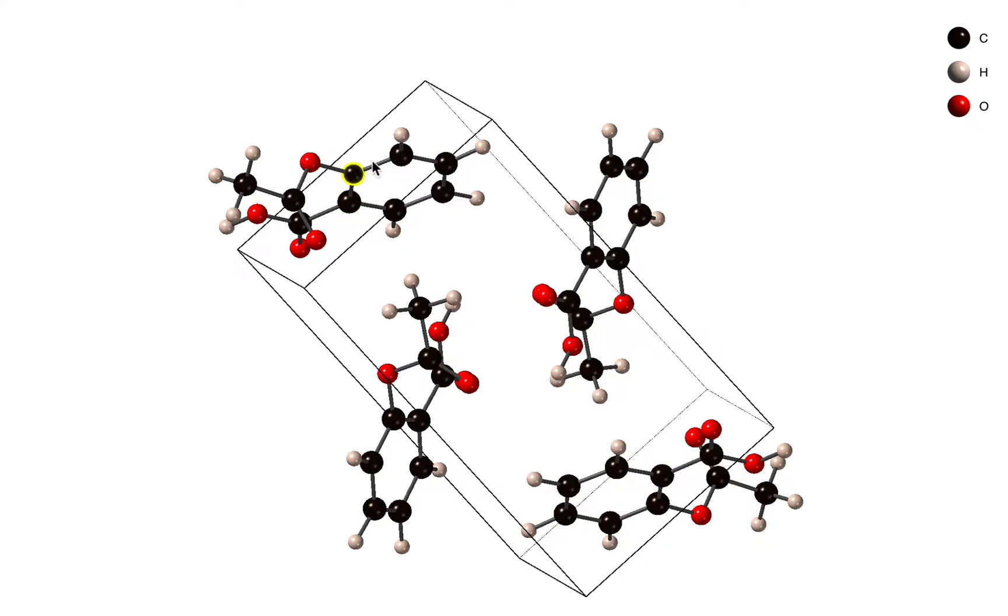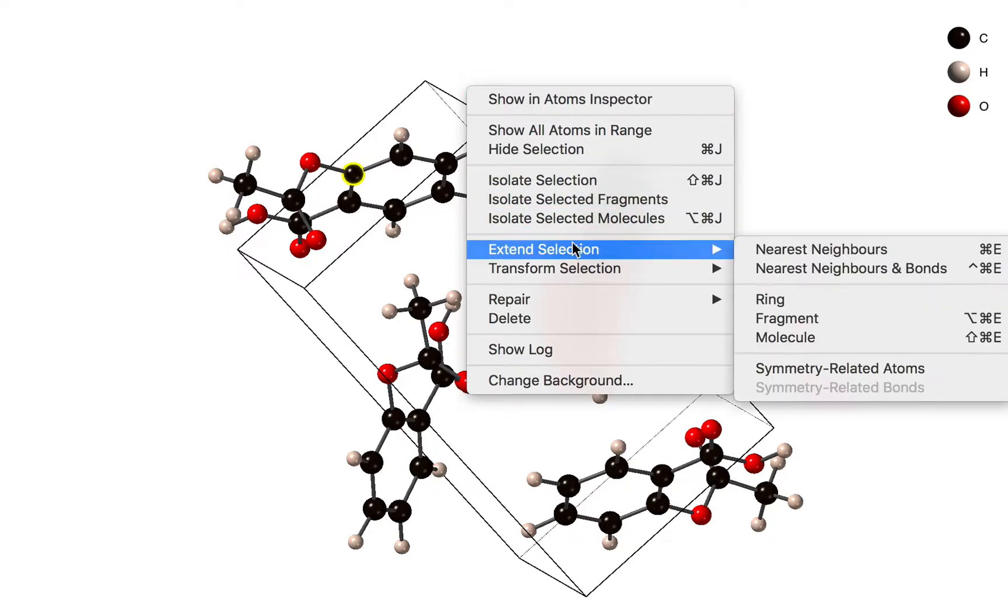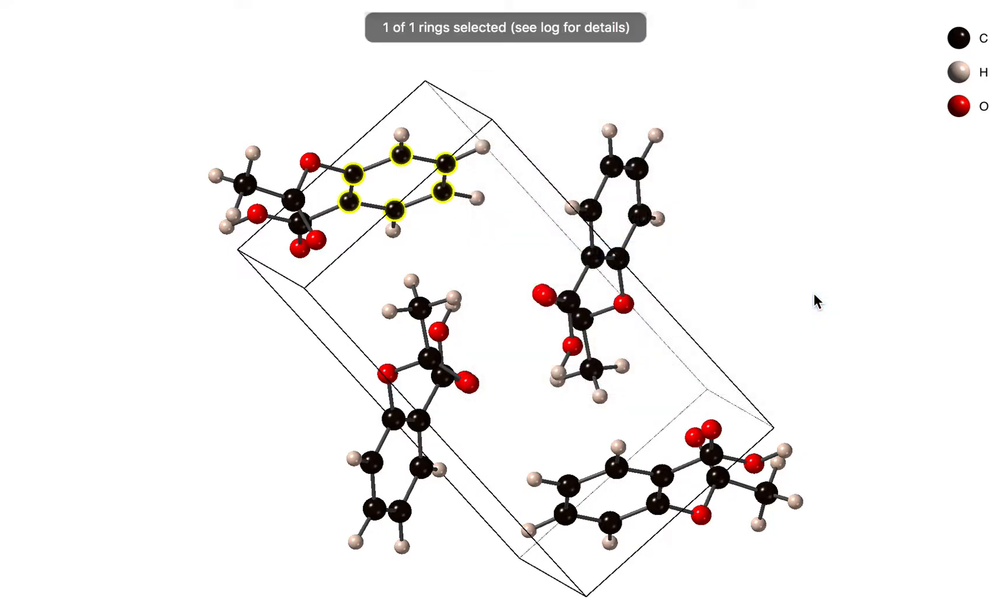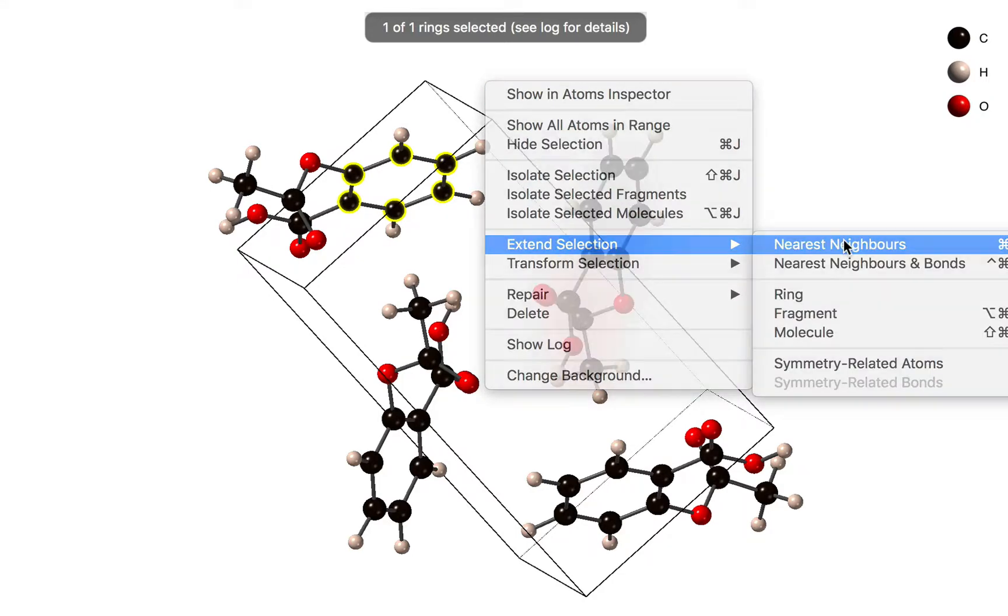So I'm going to measure the plane of the ring. I'm going to do the same thing as before. I'm going to select an atom and I'm going to extend the selection to the entire ring, and I'm actually going to extend the selection further to the nearest neighbors.